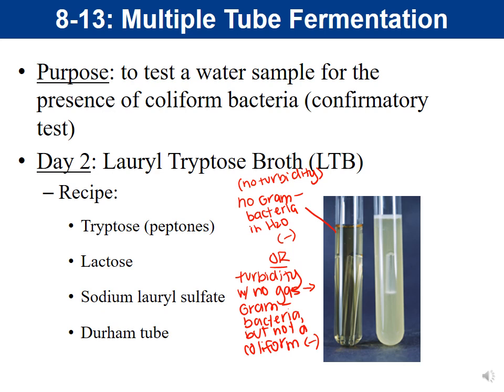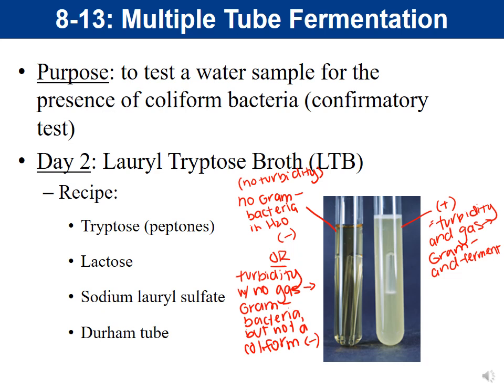That's a negative. Our positive in the LTB is going to be turbidity and gas. Because what that means is that it's gram-negative and ferments lactose.